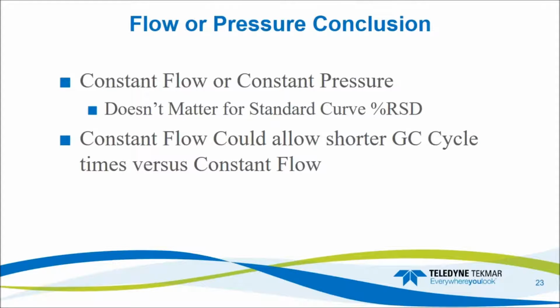So, in conclusion, constant flow or constant pressure, we didn't see any massive difference in the standard curve percent RSDs for these. The only thing that could be possible is that constant flow could allow a shorter GC cycle time versus the constant pressure.